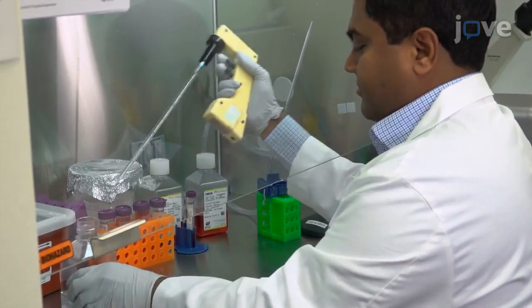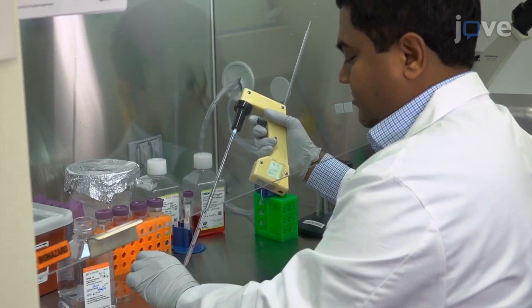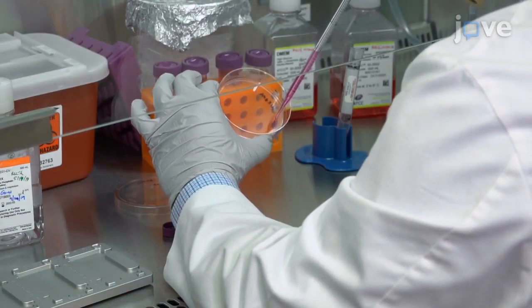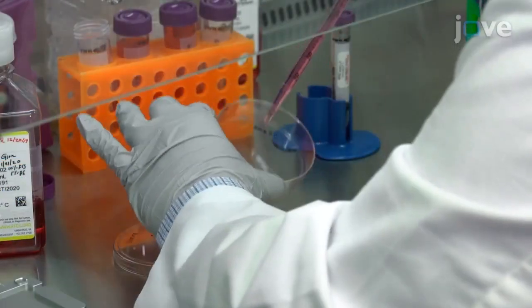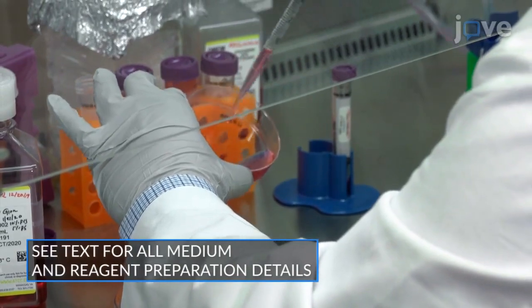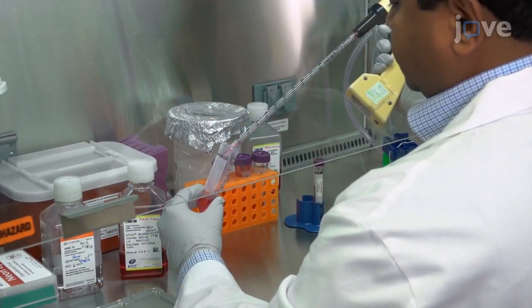When the U118MG cell line culture reaches 70 to 80% confluency, wash the cells with PBS before treating the cells with 2 milliliters of 0.05% trypsin EDTA. After 30 seconds at 37 degrees Celsius, stop the reaction with 10 milliliters of fresh culture medium and transfer the detached cells to a 15 milliliter conical tube.